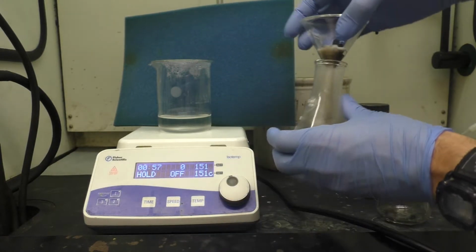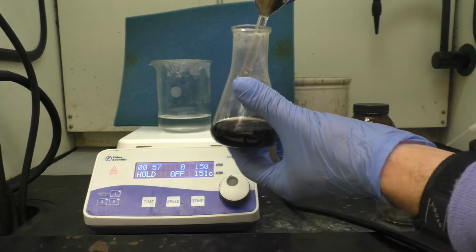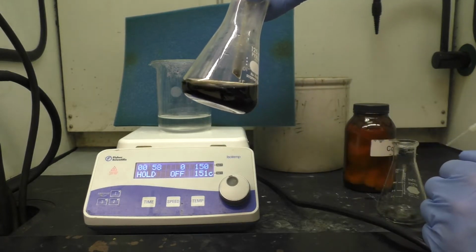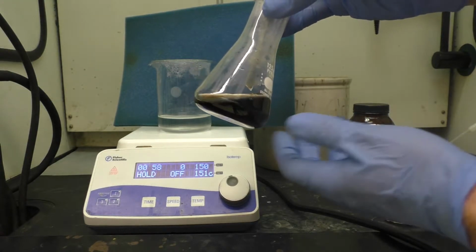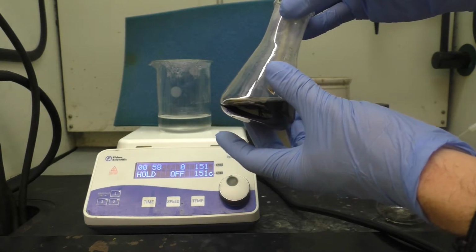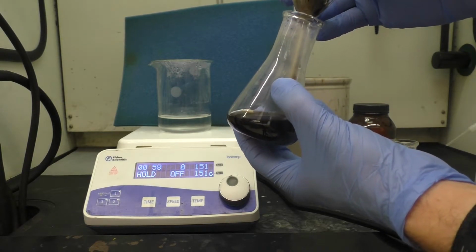Now, unfortunately, our filtrate here is quite a dark color. We've hopefully managed to remove some of the impurities. What we're going to do is try to repeat this process. We're going to add more activated charcoal. We'll weigh out quite a lot, maybe up to a gram. Just do this one more time, and then see if we improve the situation. If we don't, then we'll just carry this forward and hope that it will work in the reaction.